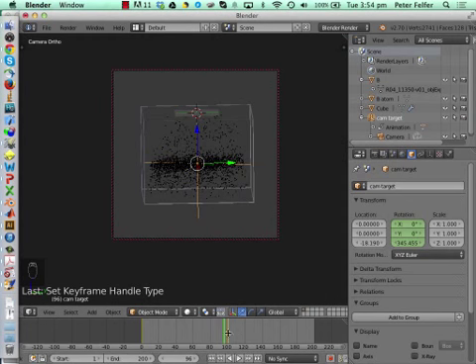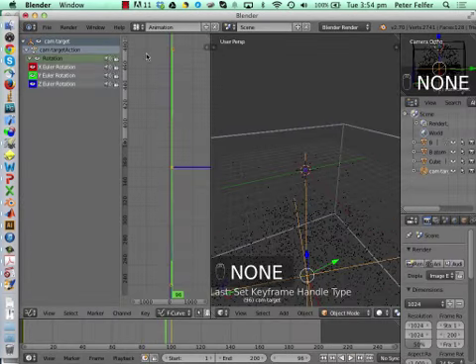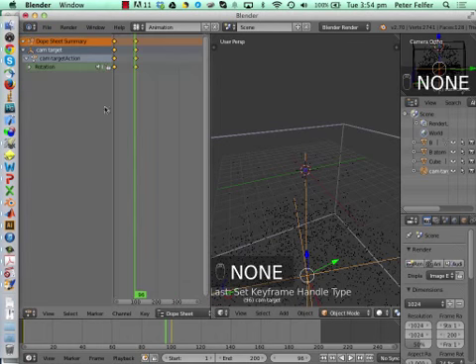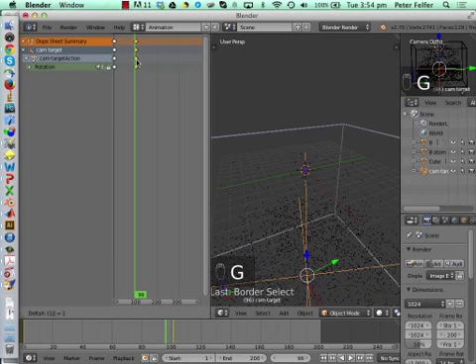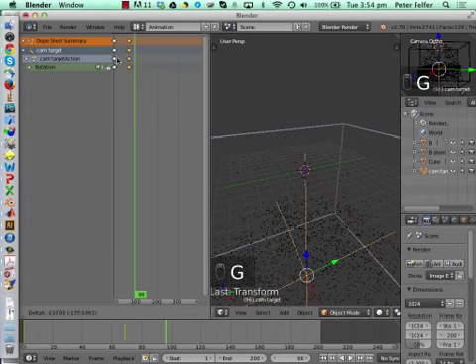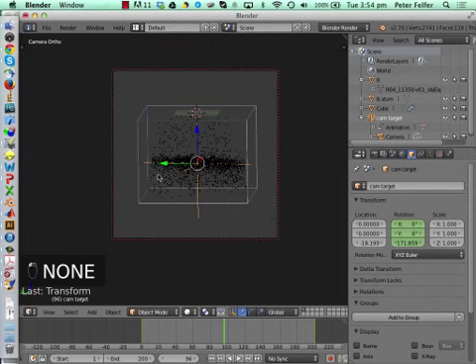And we'll just go and change the location of the keyframe, which means we go back into animation and go into the dope sheet. Dope sheet means where the keyframes are, so you can move the keyframes. We'll grab the keyframe that used to be at 100, or you can just press G and move it around. I'll move it to 200 and go back to default.